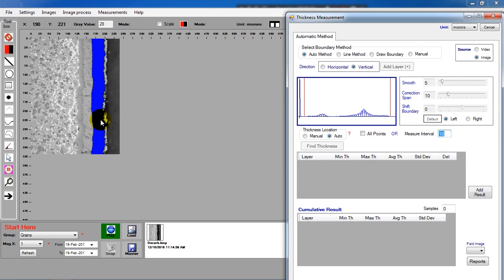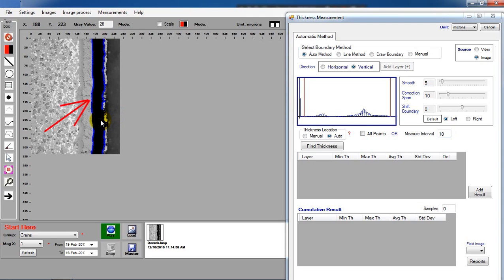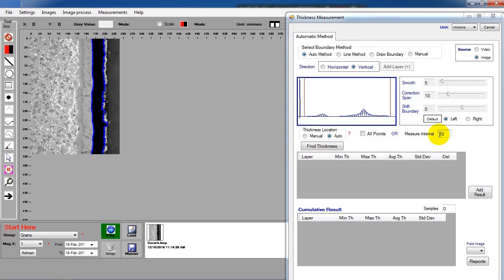Click the coating area. Here shows the boundary. Auto means the coating will be measured at equal interval of 10. You can change the number here.